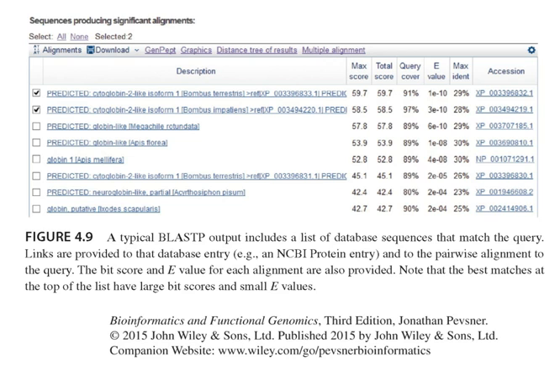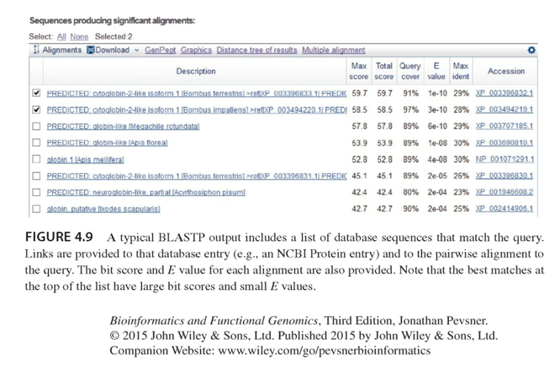Now there's another way to look at data. It's always a numeric way to look at data. What you actually have here are the responses. A typical blast output includes a list of database sequences. Note that the best searches are at the top.